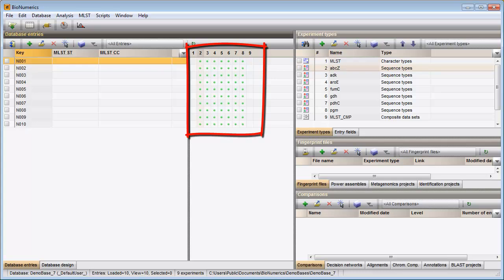Column 2 to column 8 correspond to my sequence experiments. A colored dot is displayed if a sequence is present for an entry-experiment combination.